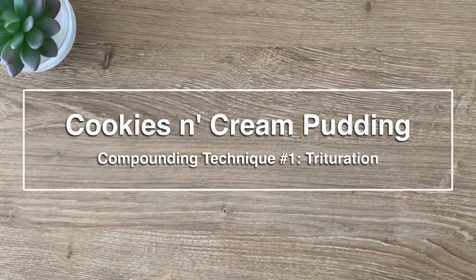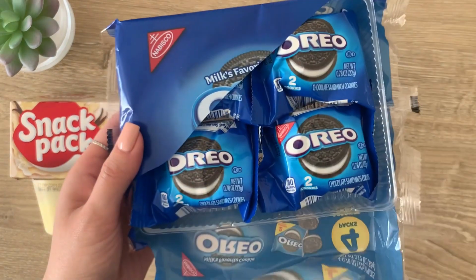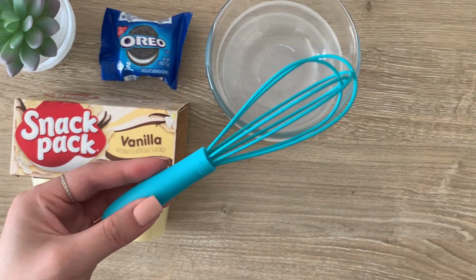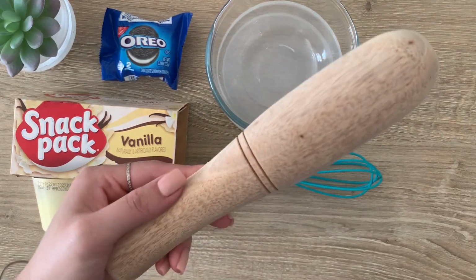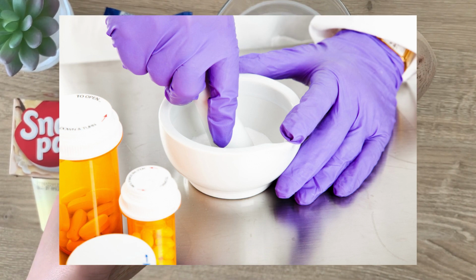For the cookies and cream pudding suspension, the items you'll need are pudding. This will act as our inactive ingredient. Oreo cookies, which will act as our solid active ingredient. A bowl, a whisk or spoon, whatever you have. And this next item you may not have on hand. This is called a pestle. Mortar and pestles are commonly used in the pharmacy to crush various ingredients.